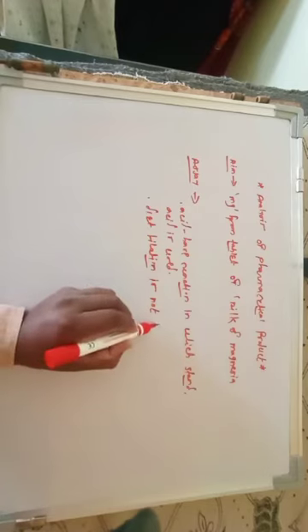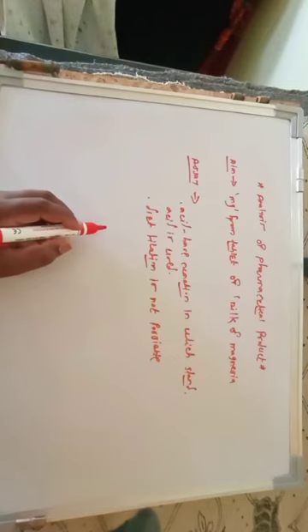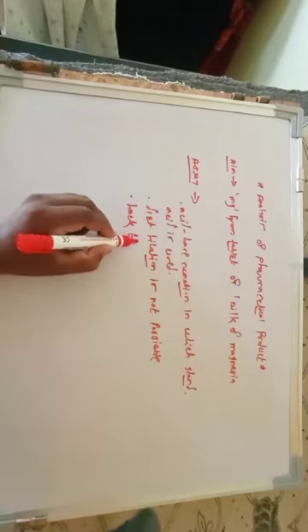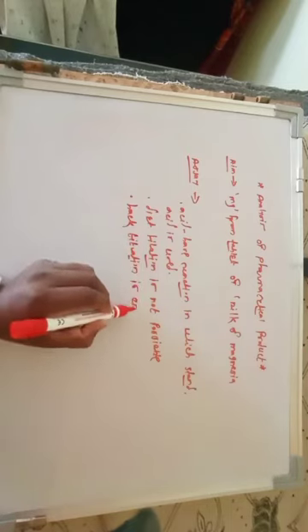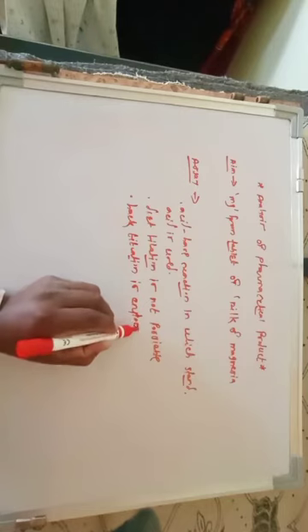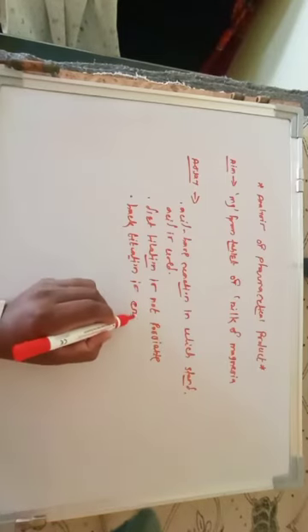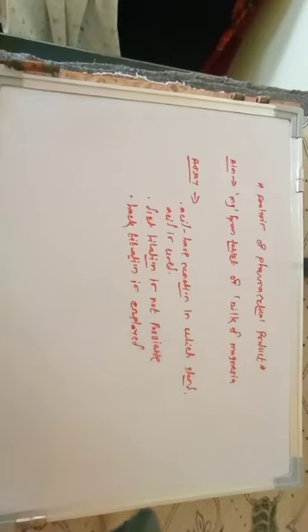Direct titration is not possible, and therefore a back titration is employed for the determination of magnesium hydroxide from this milk of magnesia.